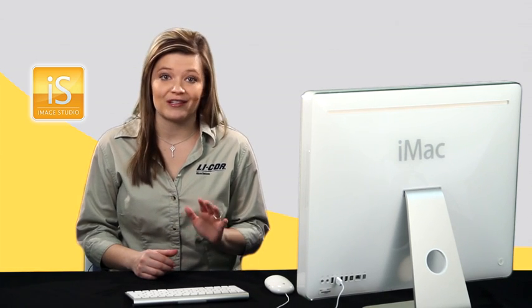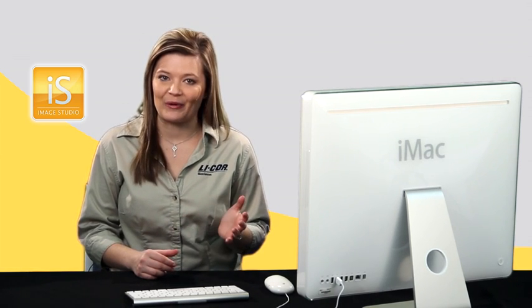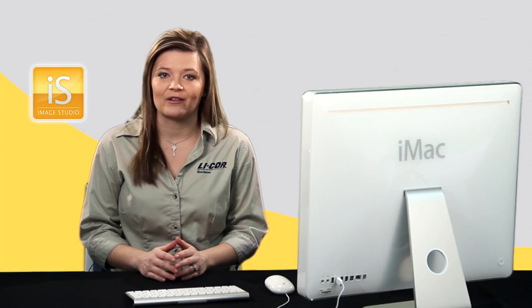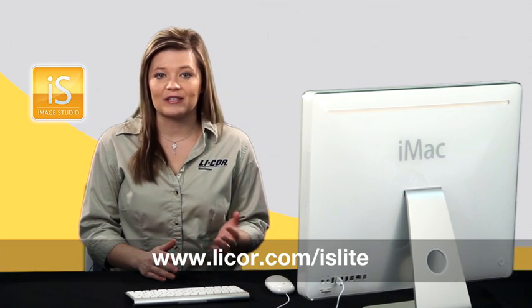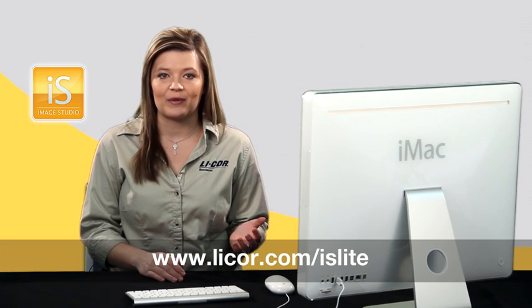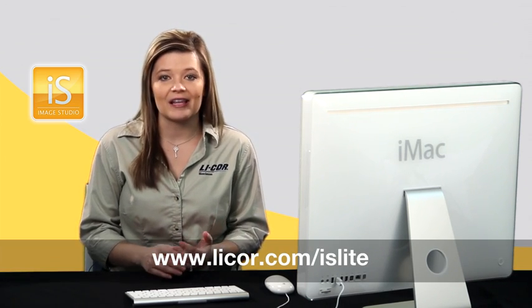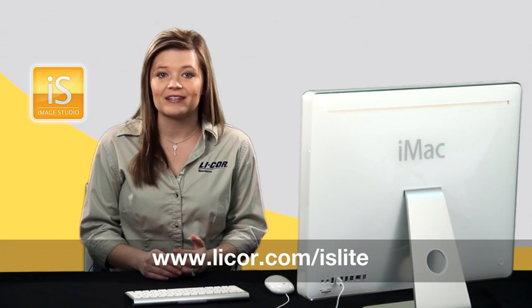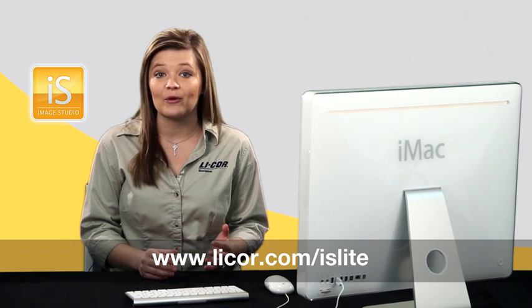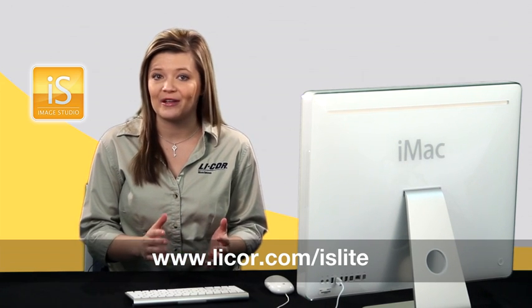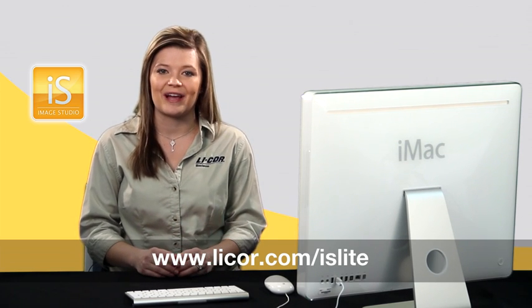With Image Studio Lite, it's just that simple. Simplify your research. Visit www.licor.com/islite today to download your free copy of Image Studio Lite.